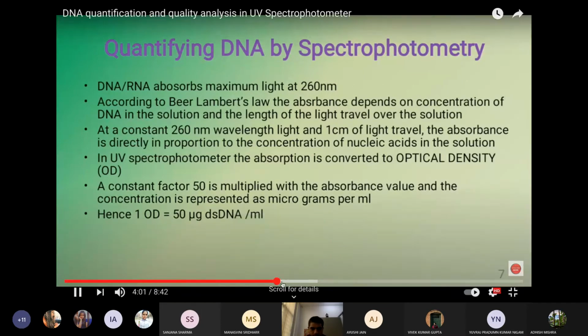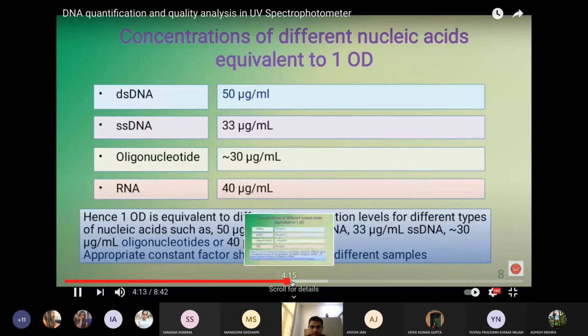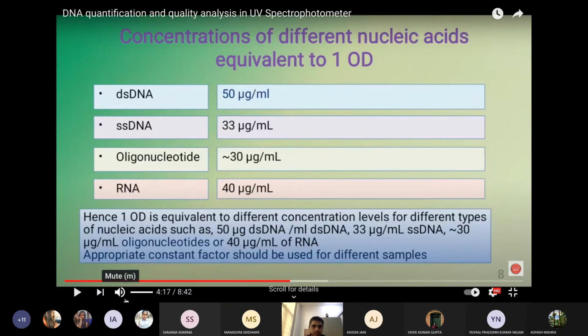A constant for double stranded DNA is 50 microgram of DNA per ml. So this is the table that I was referring to with the concentration. If double stranded DNA is there, then one OD, one absorbance reading, is going to be 50 microgram, and single stranded is 33 microgram.